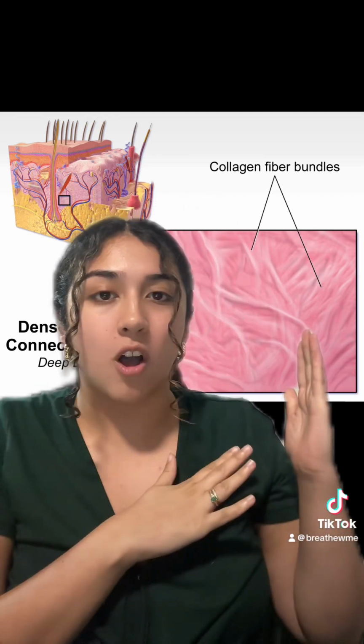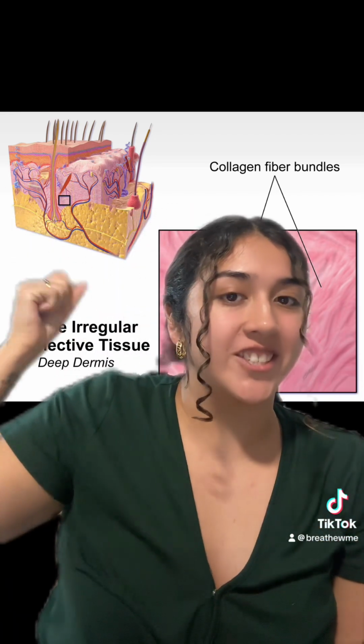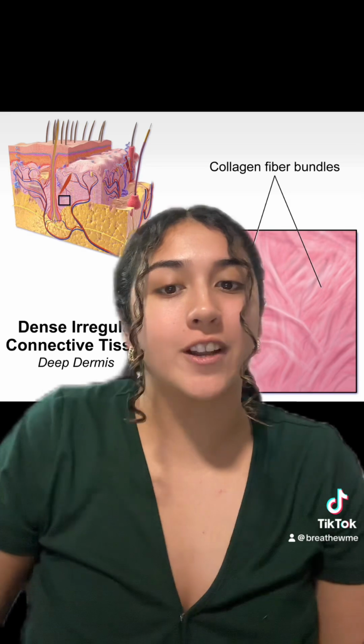Here you can see the collagen fiber bundles making up that connective tissue in the skin, that dense irregular connective tissue.